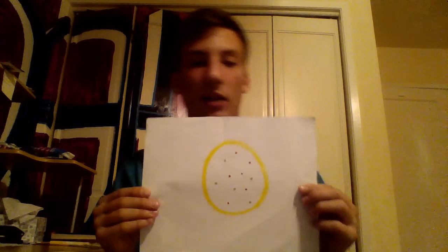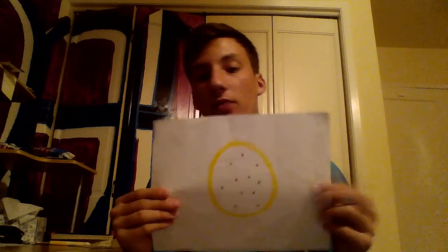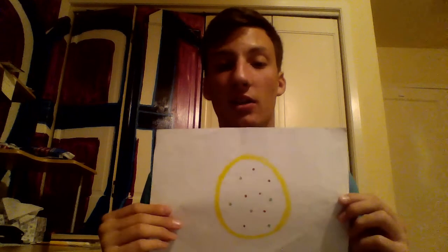Alright, so now that we have looked at a little bit about how we've made this agar plate, let's kind of go into what we do once we have this agar plate. And so what we want to do before we do any experiments is amplify the gene. We want to copy the DNA that's in these living colonies.